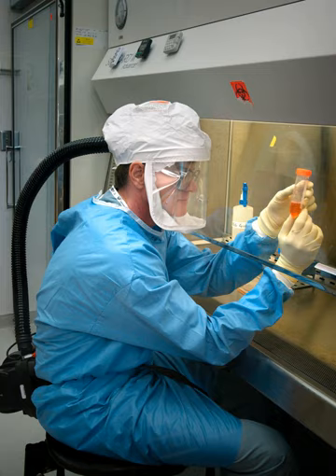Class II cabinets provide both kinds of protection — of the samples and of the environment — since makeup air is also HEPA filtered. There are five types: type A1, type A2, type B1, type B2, and type C1. Each type's requirements are defined by NSF International Standard 49, which in 2002 reclassified A and B3 cabinets as type A2, and added the type C1 in the 2016 standard. About 90% of all biosafety cabinets installed are type A2 cabinets.